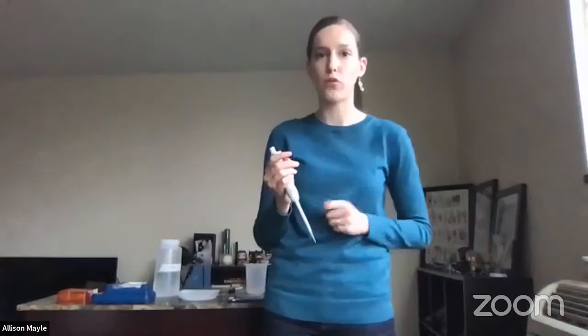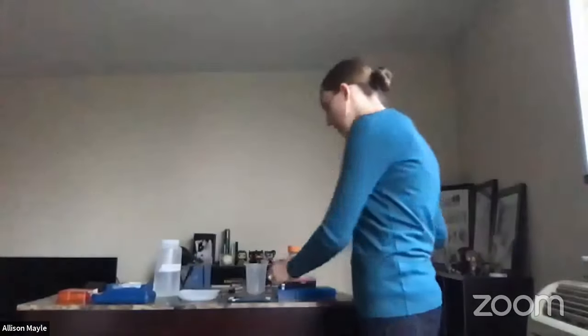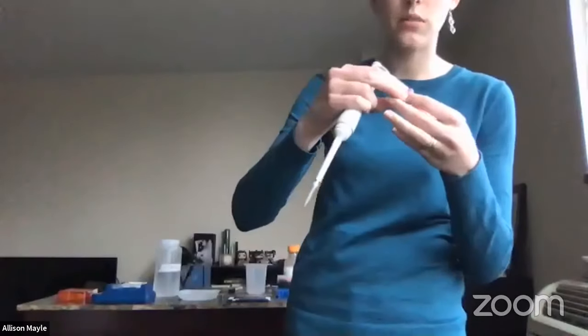A little plastic cap before they look in your ear, and then they change it before the next patient. That's what this little pipette tip is for our pipette. And so I'll just show you here with some practice loading dye. So this is just a purpley colored dye.